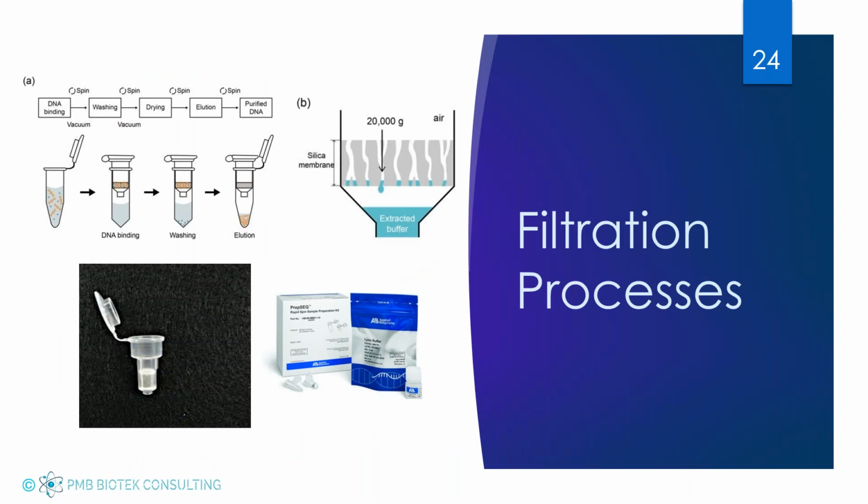So in addition to using automated extraction or IMS, you can invest in different filtration techniques to remove those inhibitors before you go to PCR. That's the idea, is that we want to try and eliminate some of these before we actually take it to the molecular method.